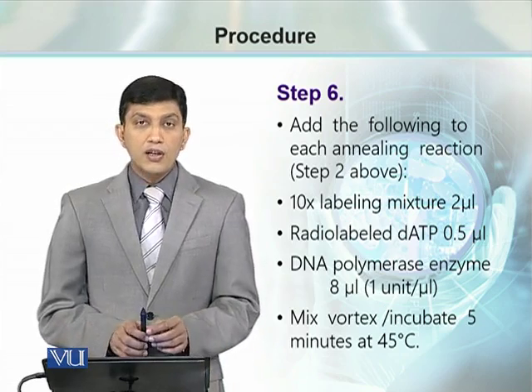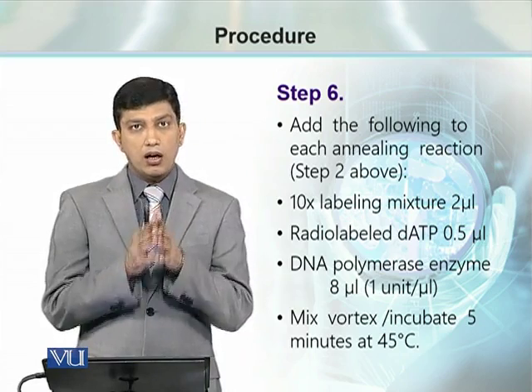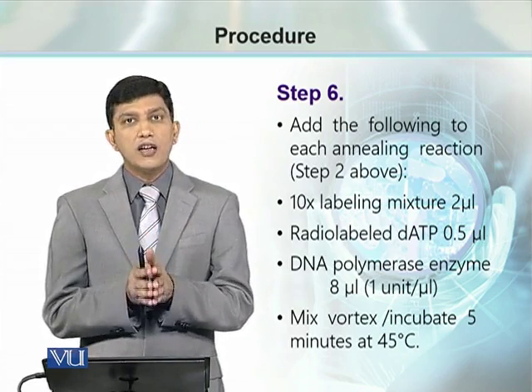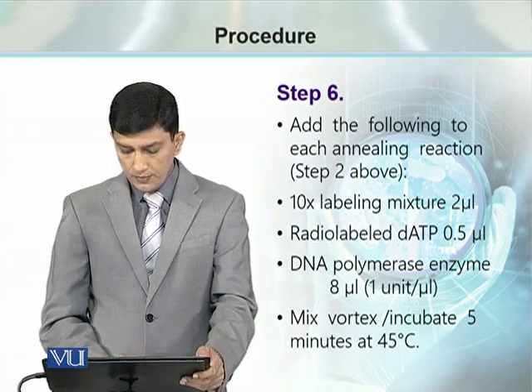This radio labeled dATP is basically to fix or to identify the starting point of the newly synthesized strand.